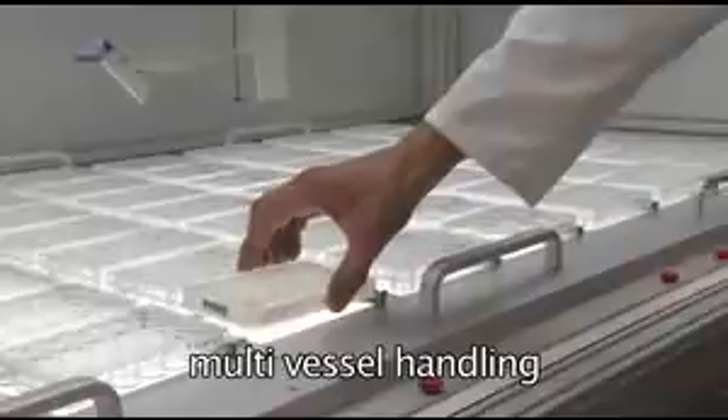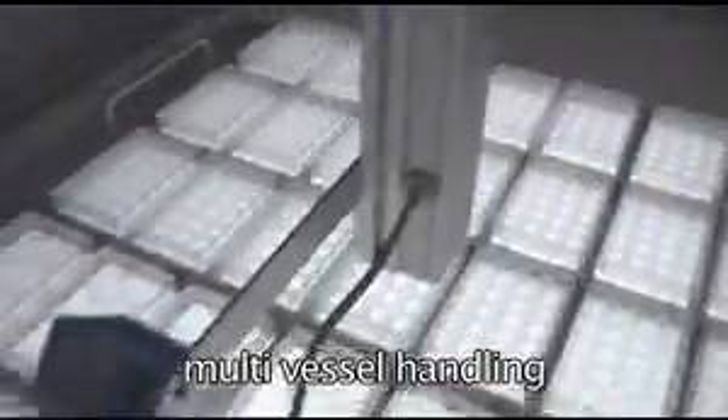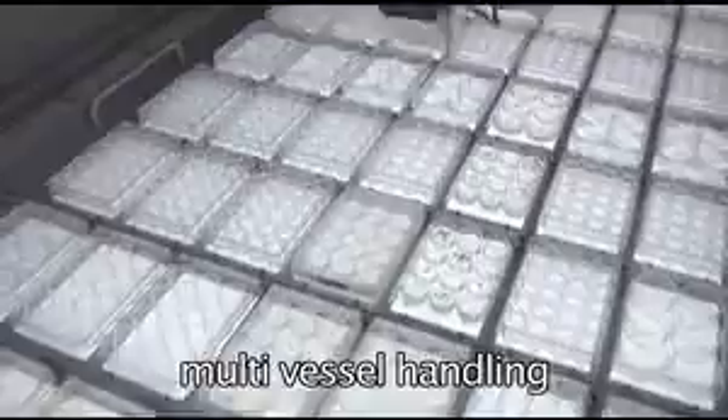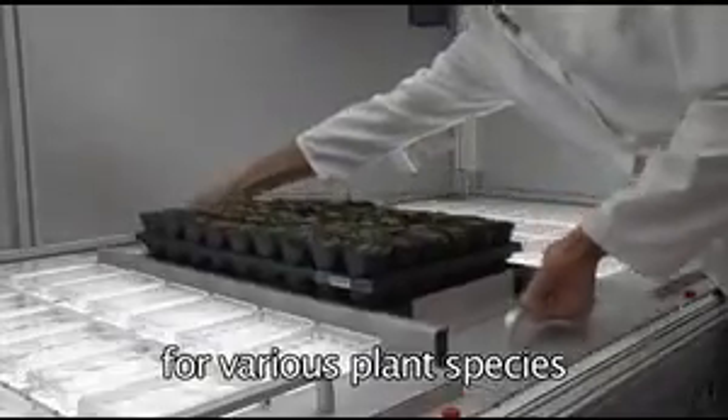Arrays of up to 30 micro-titer plates are organized in trays for easy exchange and transportation. The flexibility of the Lemnatec Scanalyzer HTS system enables the matching of requirements for various groups of researchers and biological test systems.